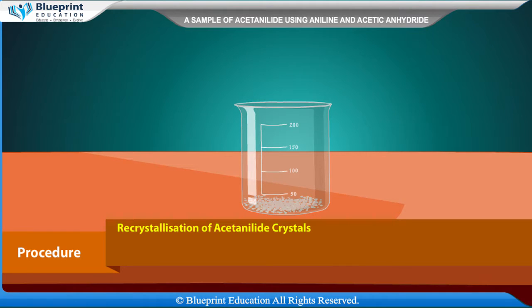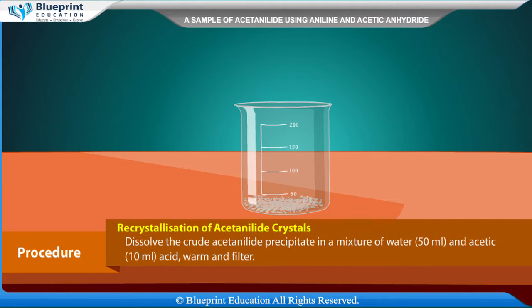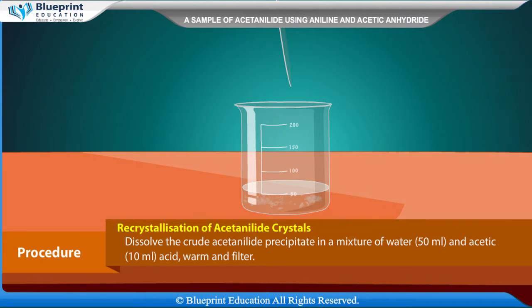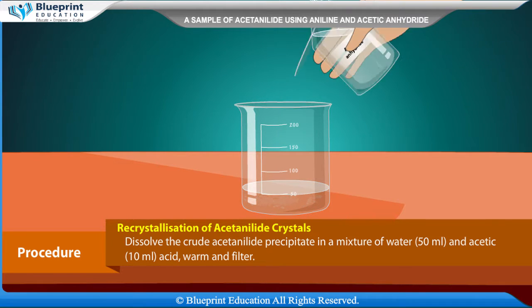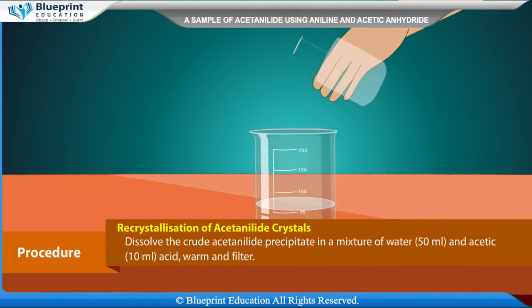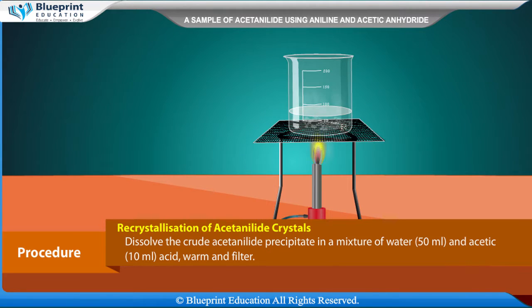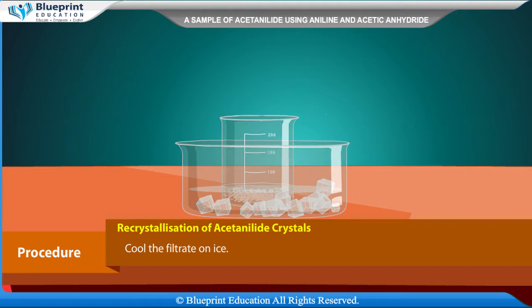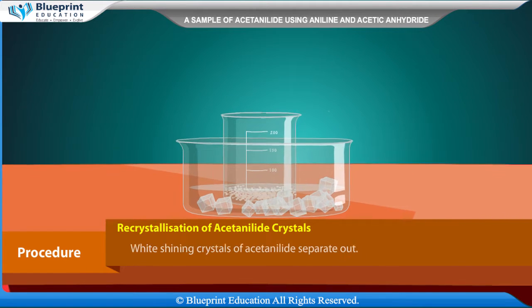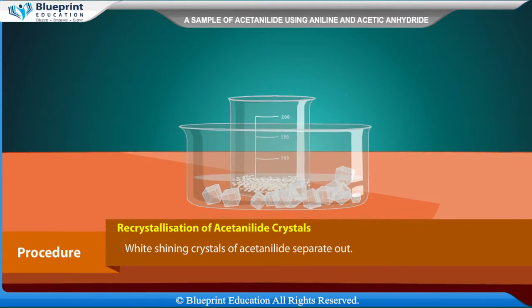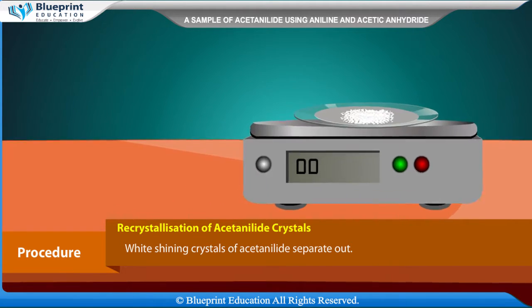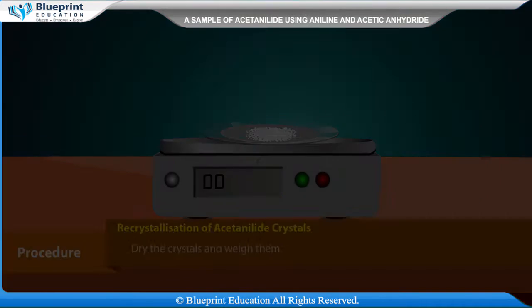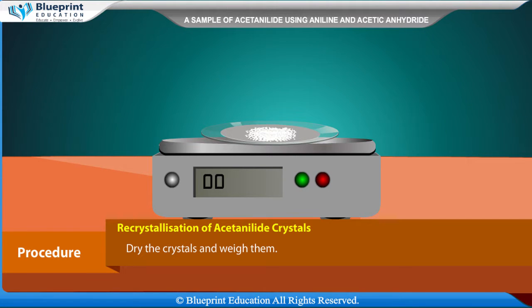Recrystallization of acetanilide crystals: Dissolve the crude acetanilide precipitate in a mixture of 50 ml water and 10 ml acetic acid. Warm and filter. Cool the filtrate on ice. White shining crystals of acetanilide separate out. Dry the crystals and weigh them.